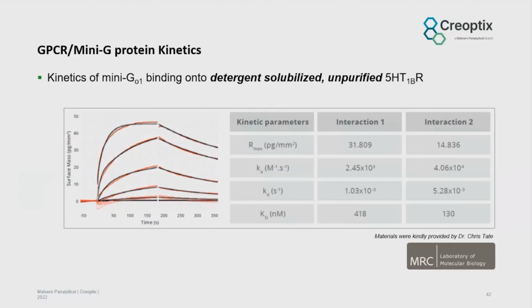The assay details are, we have an analyte, which is a purified G protein, which is DDM detergent solubilized, and we activate the GPCR with an agonist before starting binding with the G protein. Analyte plus agonist. So we run this in a competition mode using the ABA injection on our device. And here we can understand the 2 interactions which are involved for this mini G protein coupled interaction.